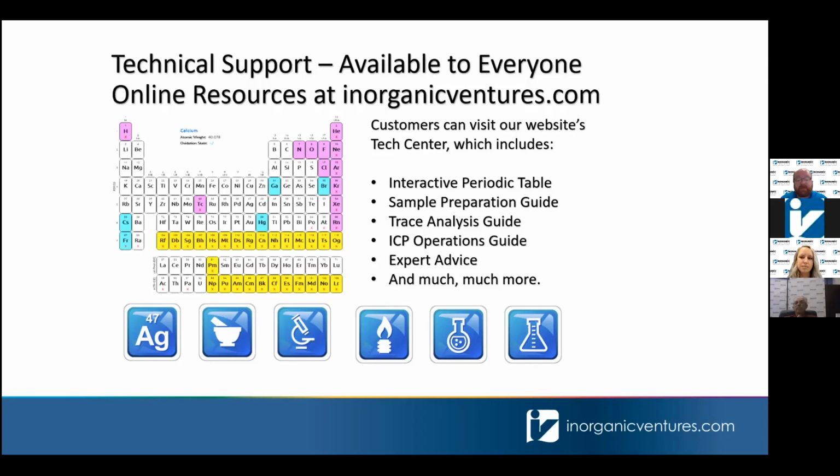So typically the final concentration of the test solutions is 15% nitric and 15% HCl. Ooh, that's pretty high. I would think so. Wouldn't you, Autumn? Yeah, I was going to say it depends on how high your hydrochloric acid matrix is, but it sounds like you have a pretty high matrix, so that should stabilize the tin that you have in there. And again, it depends on the tin concentration as well, but I'm sure you're running low enough levels that 15% is going to be plenty for stabilization. And yeah, that should be good.